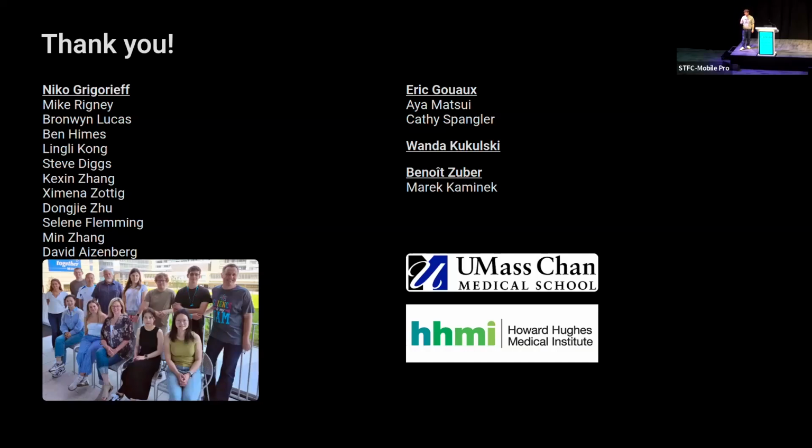Yes, I imagine it would be very hard to correlate one specific region with another one. So I think what we should do is this montage thing where you image the whole slice, and then it's much easier to align two whole slices together than one specific feature, which might get lost because it's over a grid bar. These are all problems.